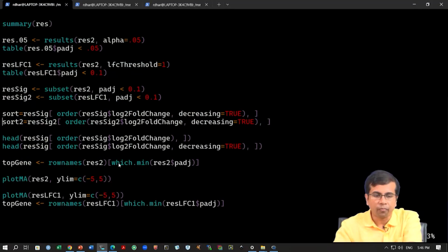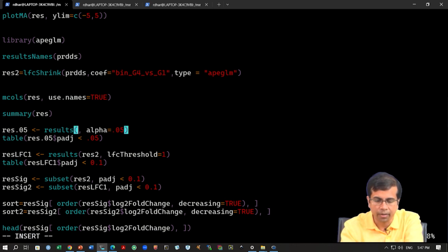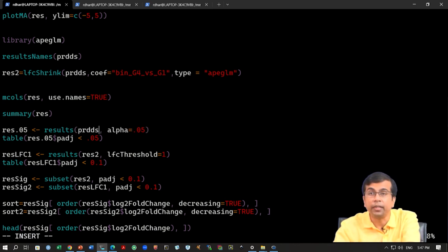Okay, all right. So what we can do is set our own filters, and we can run these different p-adjust cutoffs. So we can change the FDR cutoffs, and we can also change the LFC threshold cutoffs. Okay, so we'll try that using the results that we have generated, but we then have to run this on the DESeq object, right?